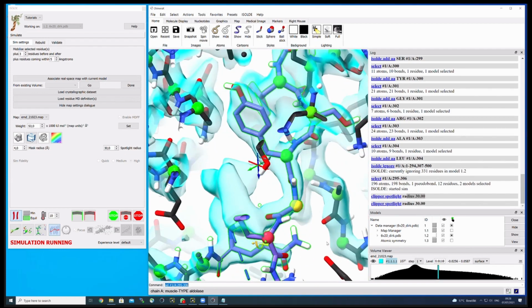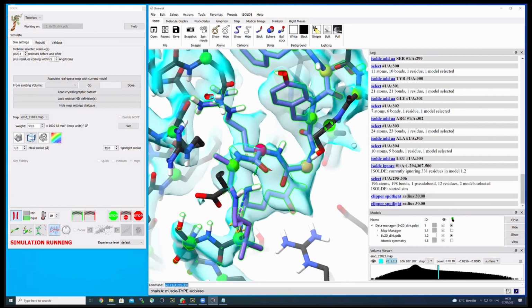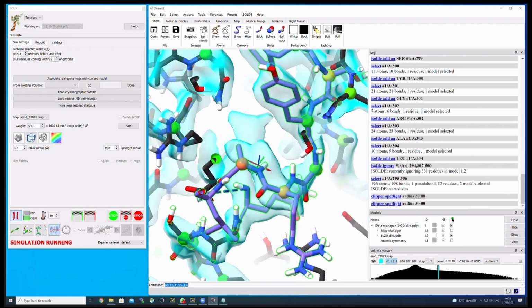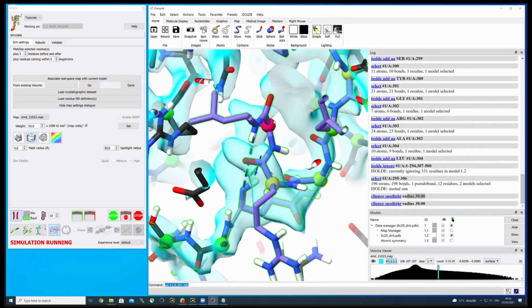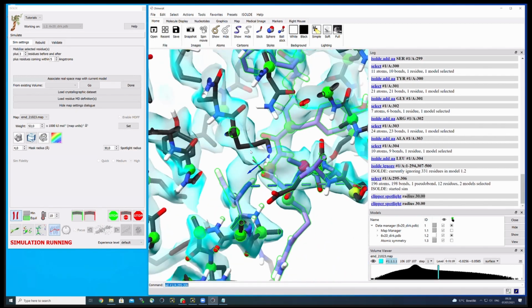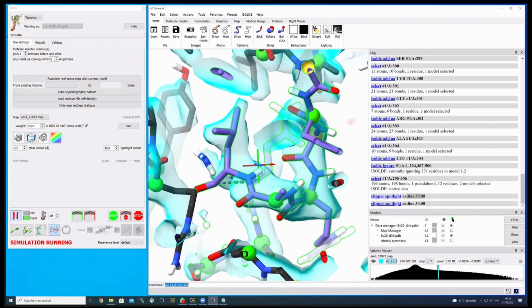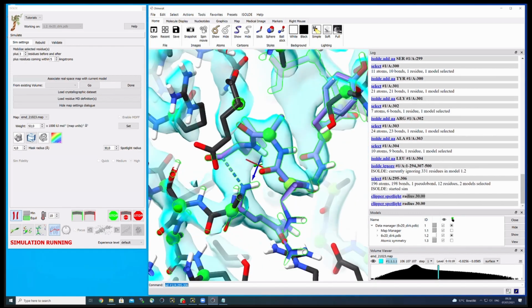Yes, and like this now we can basically take all these residues and put them into their densities, and I think this of course depends a little bit on experience to make this as quick as I'm doing it, but in general this is what it is. So two new functions that I would like to introduce, and this is basically now more or less in the correct spot.